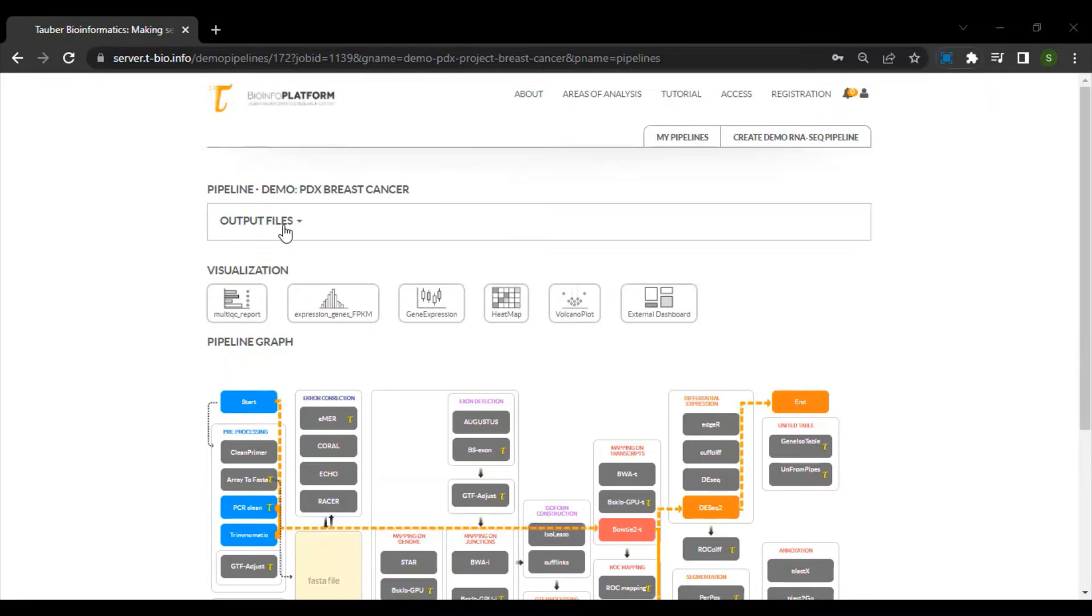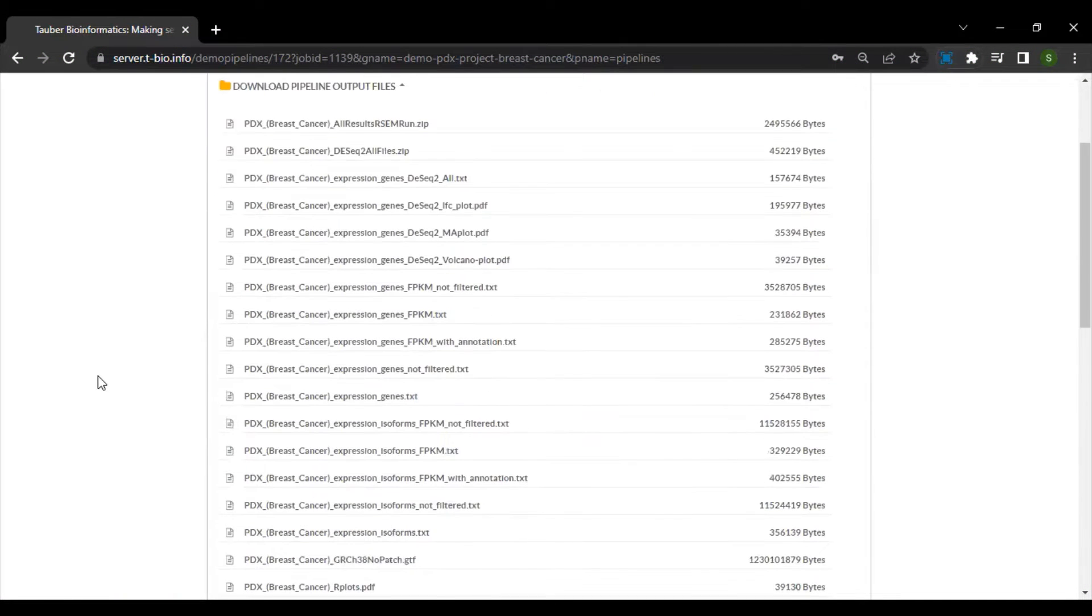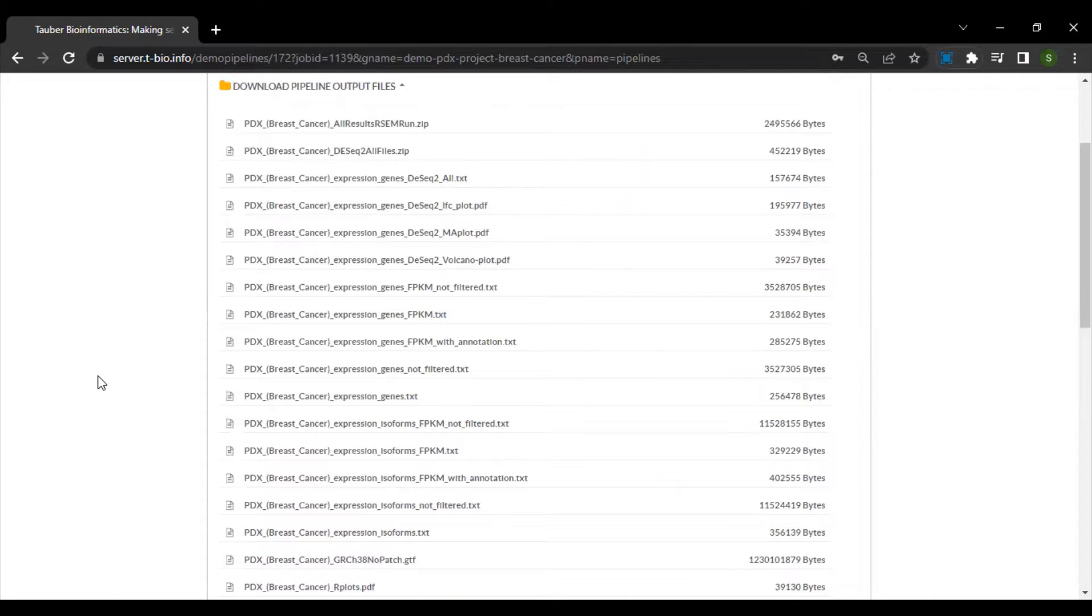Here in the download folder, you have many types of expression tables. First of all, there are gene expression tables and isoform expression tables. We provide these expression tables in FPKM and in raw reads.